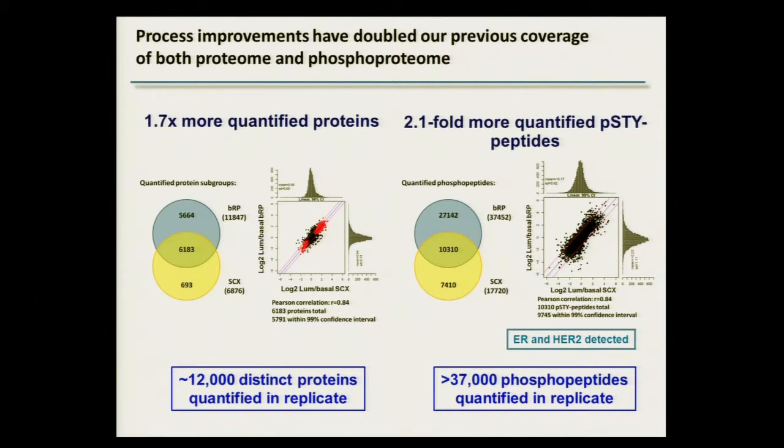So, yes, please. So it appears that for multiple steps there are variants: for enrichment, you do different approaches; for digestion, you do different approaches. But what is the biggest source of variation? And how do those things affect coverage of phosphoproteins?